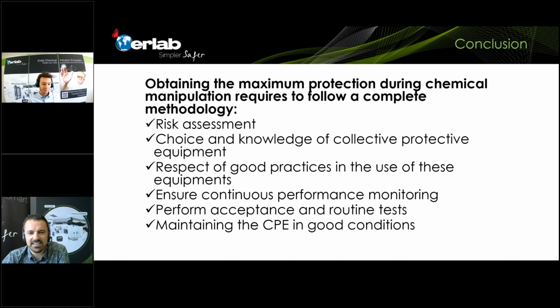So we had in the meantime new questions. Sometimes we need to use chemicals in biosafety cabinets due to the samples. Is it possible to add chemical filters to such cabinets? It's a question from Sean Baldacchino. And I won't tease you, but the answer is no.